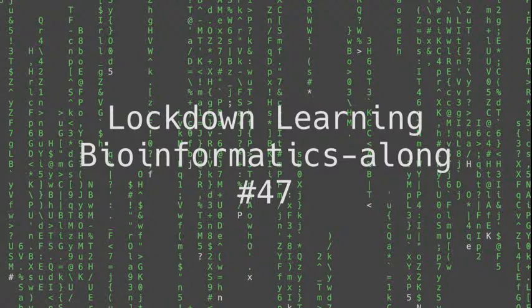So what I'm going to do today is talk a little bit about some things that we can do with that BAM file. Today and Friday are going to be about the things that we're going to do with that alignment now that we've generated it. Particularly today, I'm going to look at visualizing alignments.